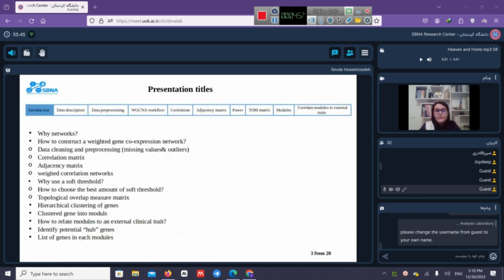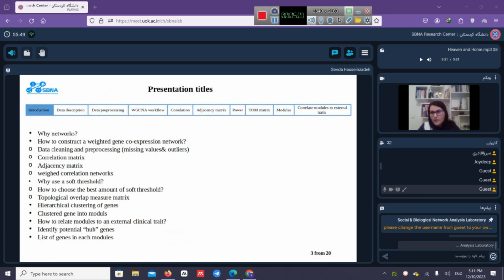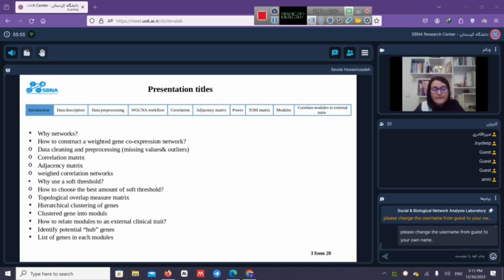These are my presentation titles. At first, we're going to talk about why network: why it's better to use a network instead of an individual list of genes. And how to construct a weighted gene co-expression network, and what types of data are suitable as input data for WGCNA.